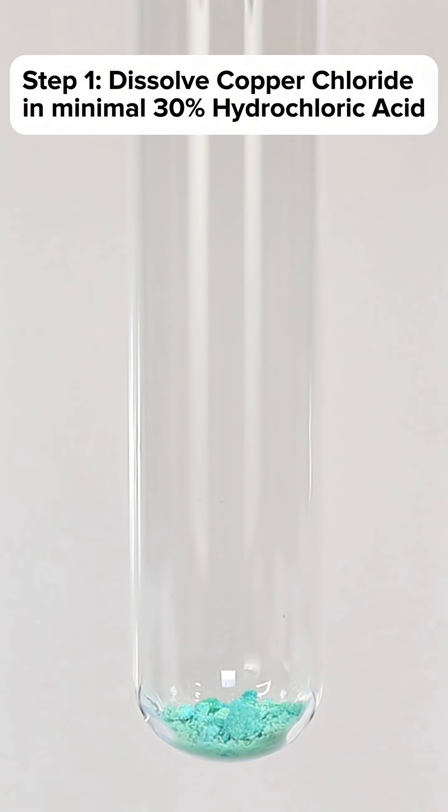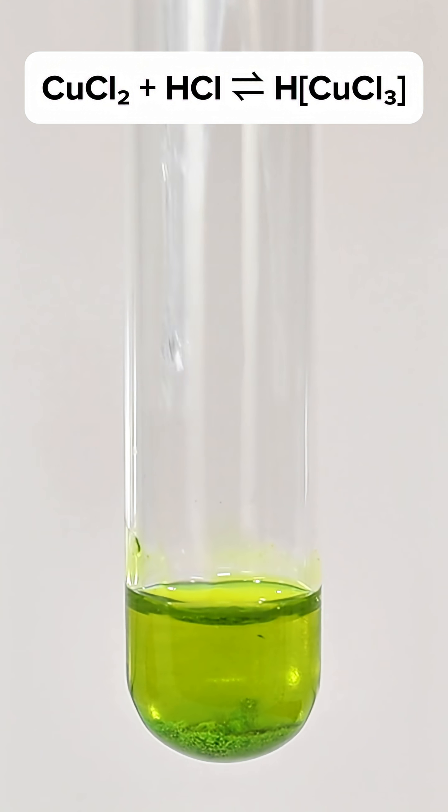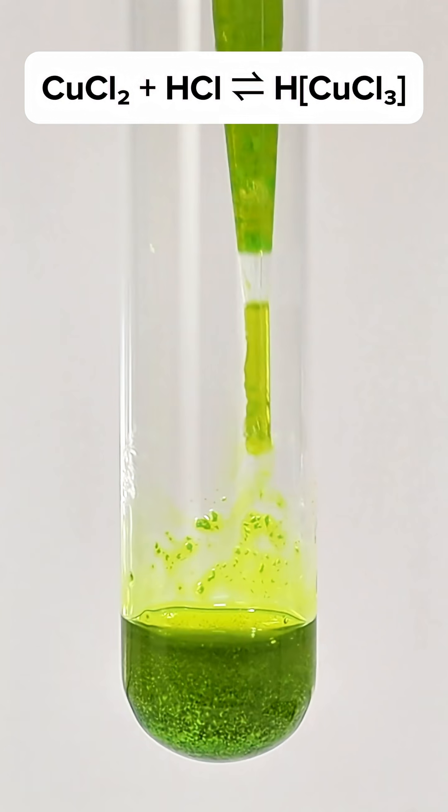To get started making it, I begin by adding some copper chloride to a test tube. I then add a minimal amount of concentrated hydrochloric acid and stir the two until the copper chloride is dissolved.